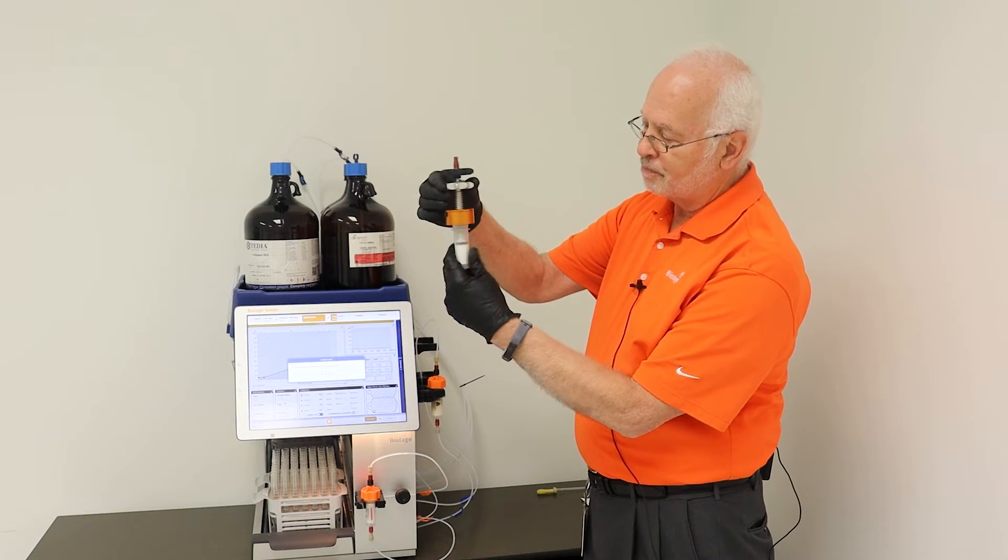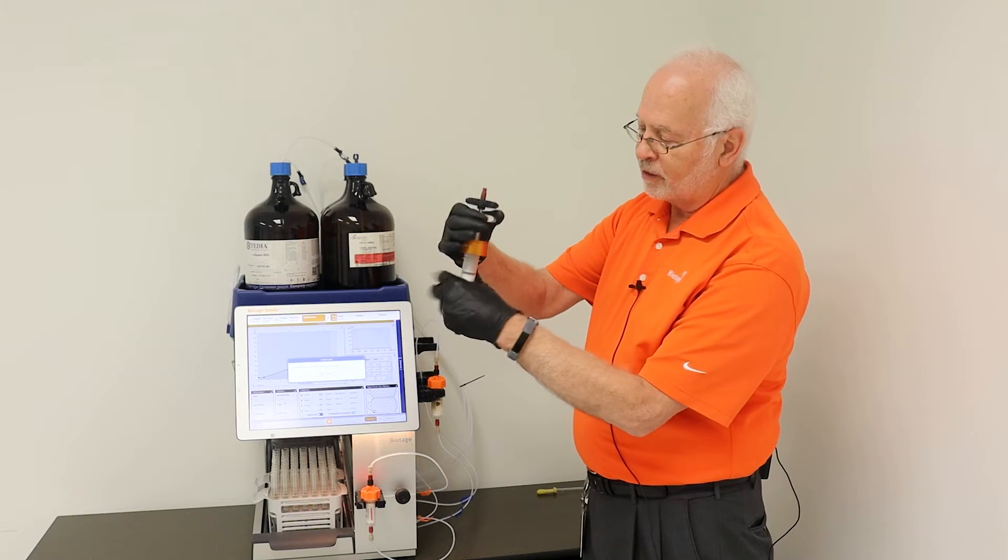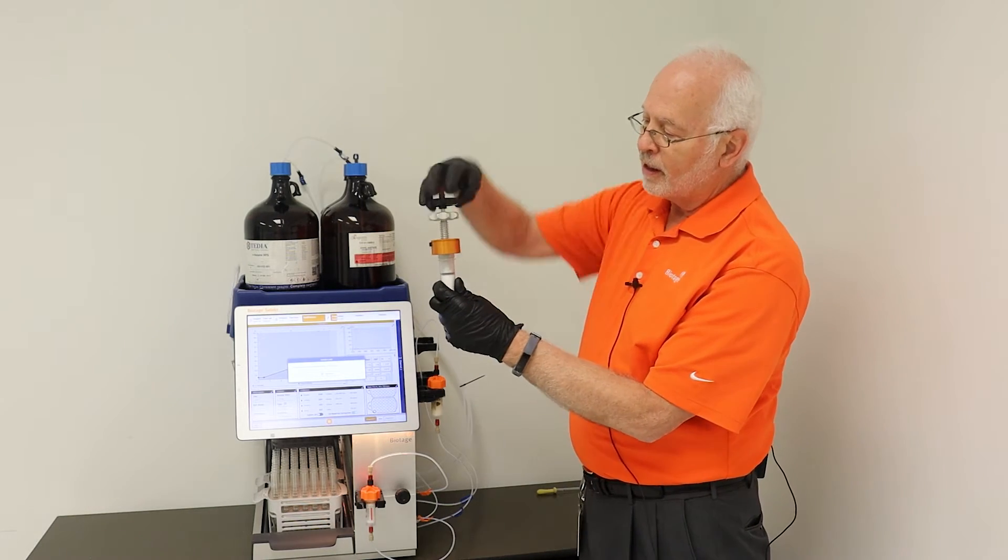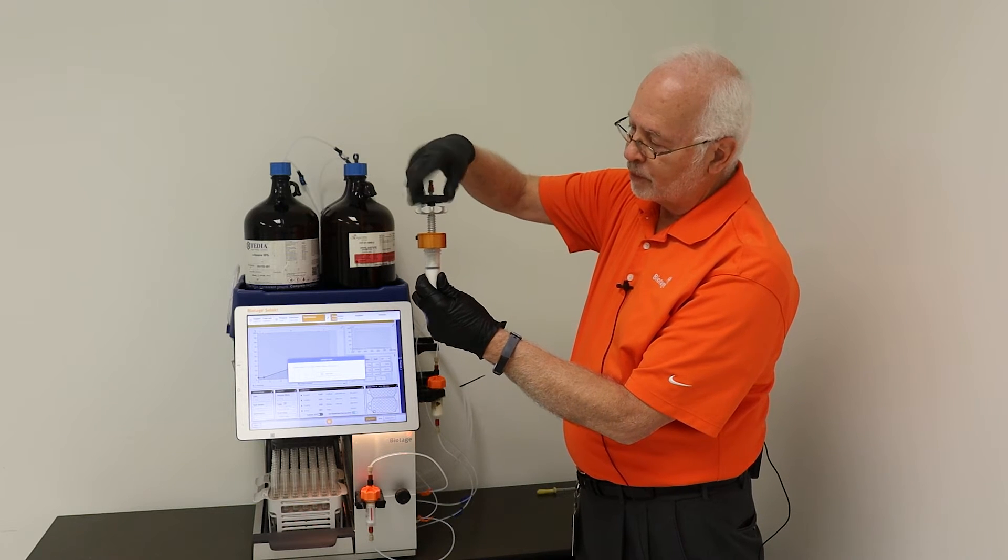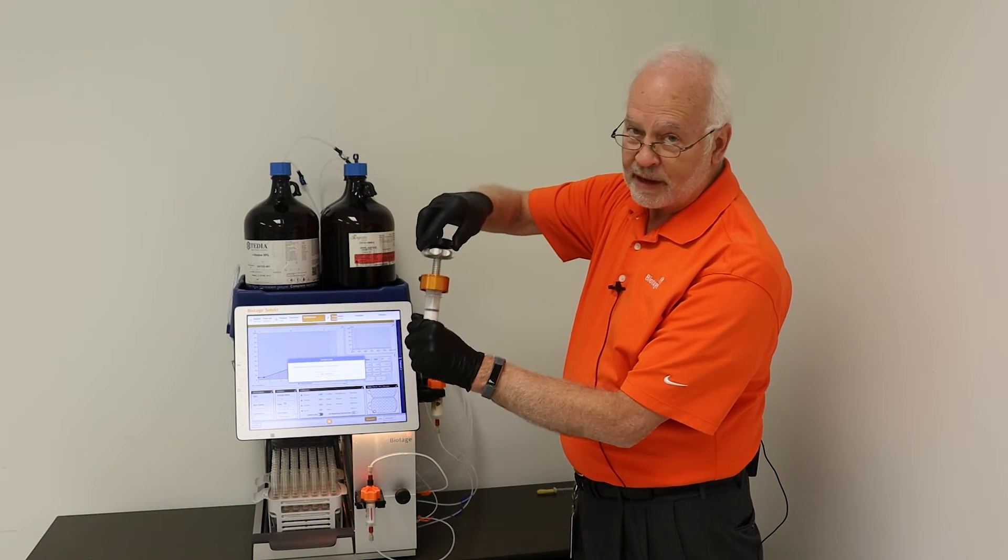You then tighten the piston so that it's snug against the top of the bed and then you can tighten the O-ring with the black knob and that's going to make a liquid seal.